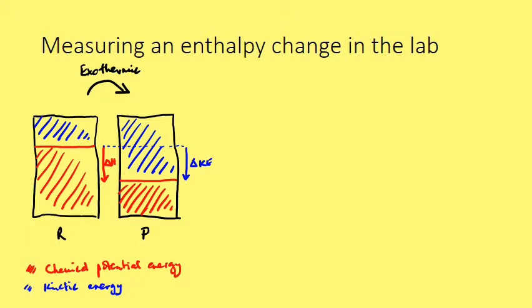If we say that the change in kinetic energy is the same as the change in enthalpy, then if we work out the change in kinetic energy, we will have the change in enthalpy. So that's what we're going to do in the lab.